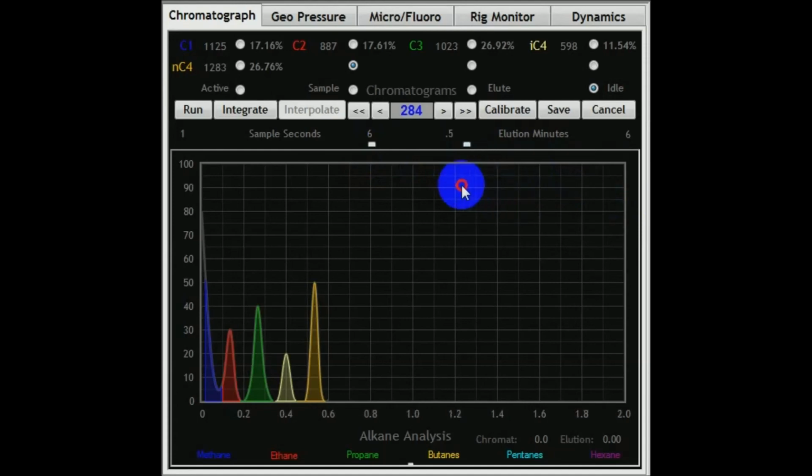Here we're changing our elution time. In an earlier part of the well, you may only be concerned with methane and ethane and wondering, is propane even available? In the 30-second, our first click, a 30-second elution will give us methane, ethane, and propane in about 30 seconds. About half of the propane peak will be exposed in 30 seconds. If there's no propane, you can continue running 30-second intervals, just to give a quick check shot and be ready for the next one. If you see propane, then you can lengthen the time of elution to encompass that curve as well, and any others that follow.